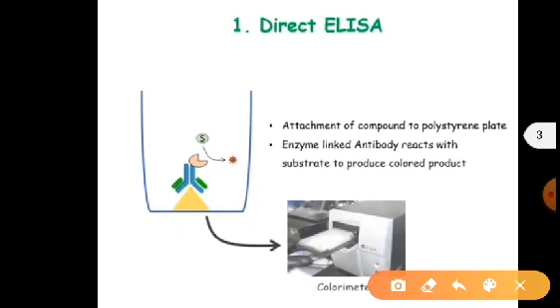In this method the sample is attached with well. After that primary antibodies are added and the plate is incubated. After that wash is given.